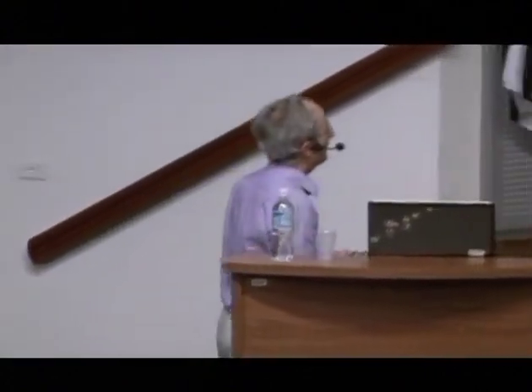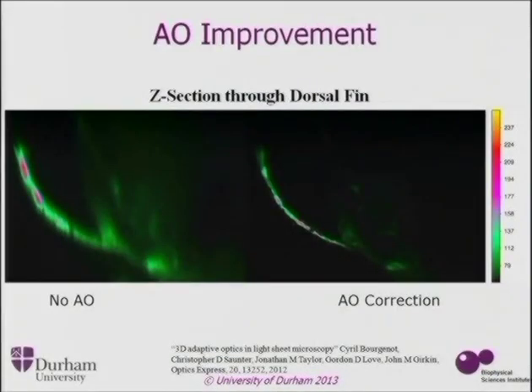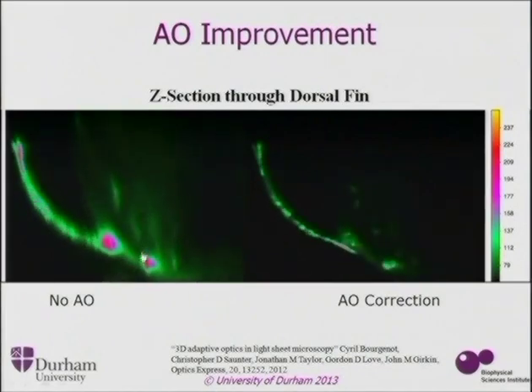This is an example. This is actually using it in our SPIM system. The image on the left is the uncorrected one. This is the image on the right. And as I play it through, you'll be able to see, I'll just choose somewhere at random, how much clearer the image is over here. In fact, you can see very clearly, if you look at it manually, individual cell membranes, whereas here it's obviously just become a complete blurred mess.